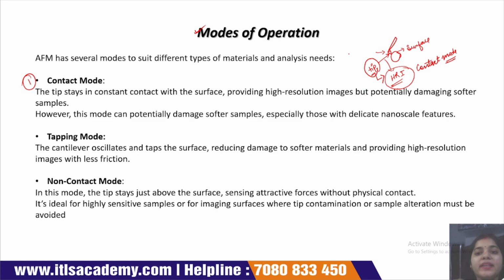There is a drawback of this mode, and the drawback of this mode is sample damage.